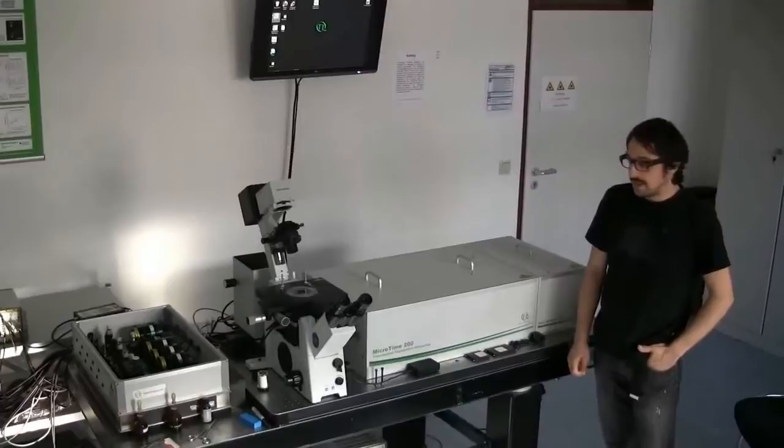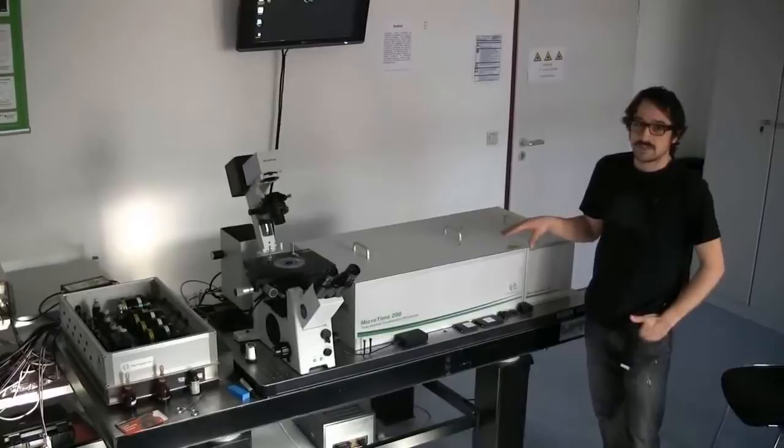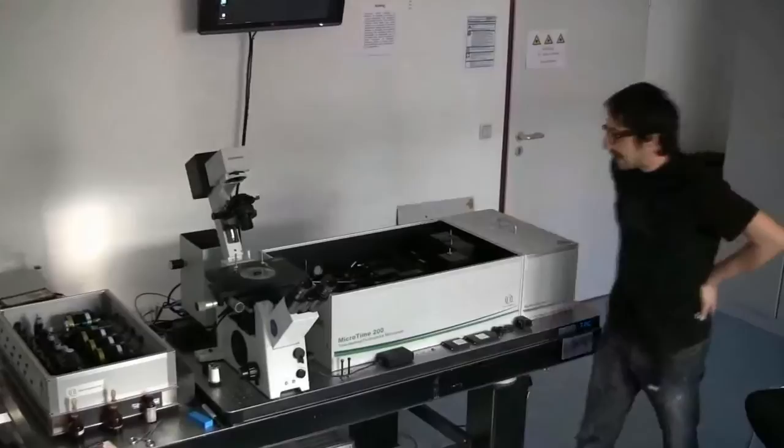It is a time-resolved machine and unlike other microscopes you may have seen, this is a rather big system sitting on this table here. The special advantage of this system is that you can actually take off the lid and do things here on this microscope. You can have a look at what is going on inside, or you can have a look at the confocal setup, which is here on the right hand side.